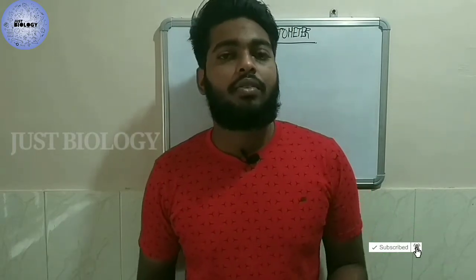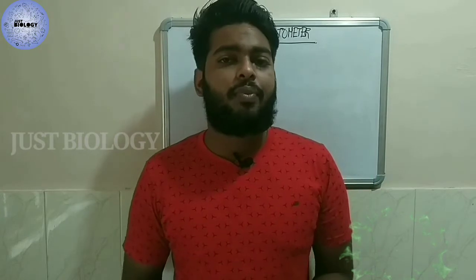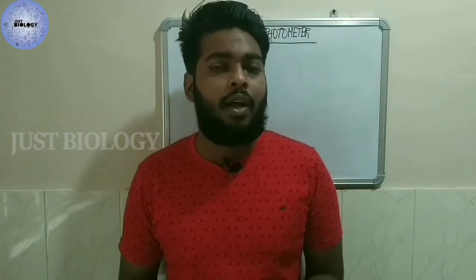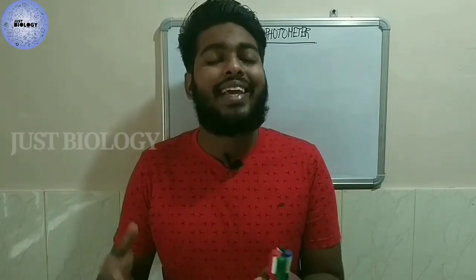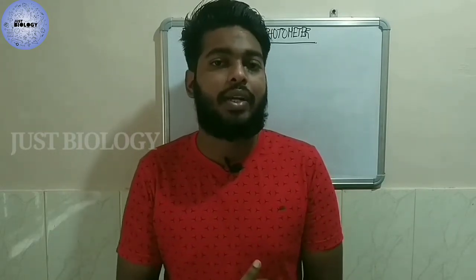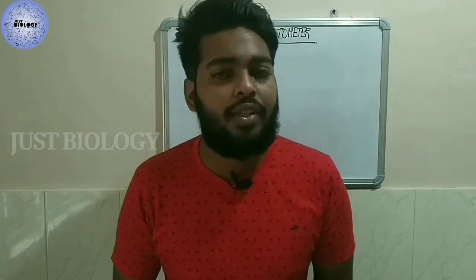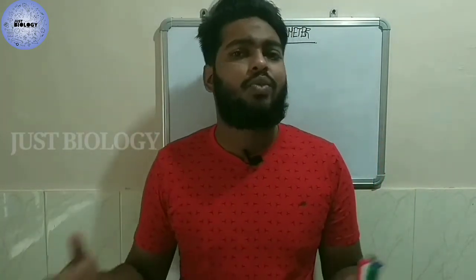In this lecture we're going to talk about the spectrophotometer. If you see this spectrophotometer, we could see many variations. But each and every spectrophotometer has its distinct usage when compared to the normal one. In this lecture I'm going to discuss a basic spectrophotometer, like UV and visible.